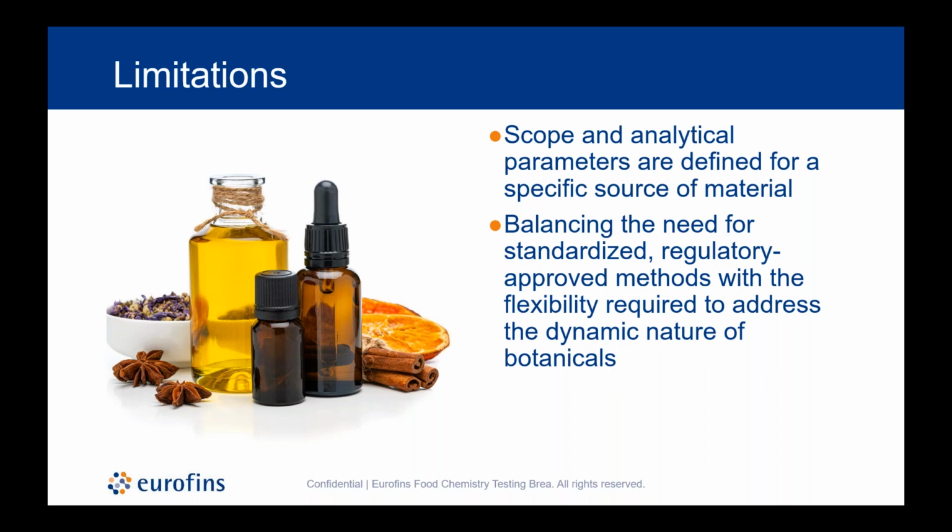And so that limitation of balancing all of those factors with the regulatory compliance that is needed and the desire for a standardized method is a story that's as old as the botanicals industry. We just want to highlight that as a known limitation, but that's what leads us to those conversations about an OOS result and making sure that we support you through the entire process, from submitting a sample to discussing the results and taking any next steps that we can to continue to support you.